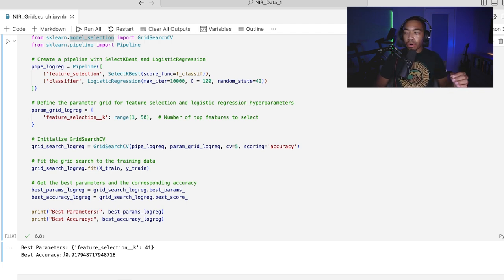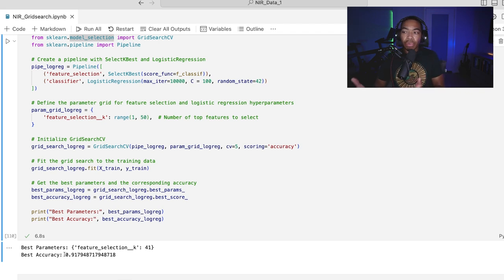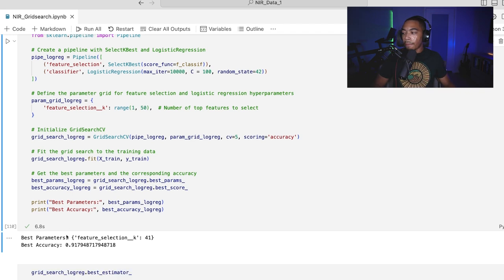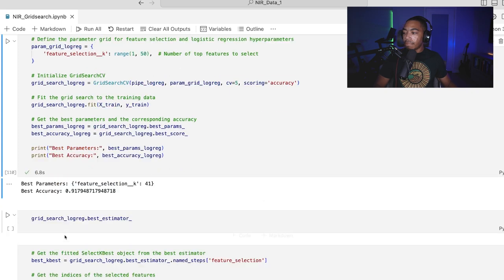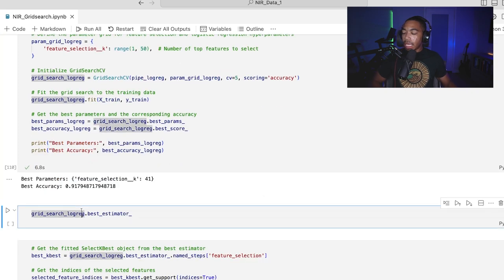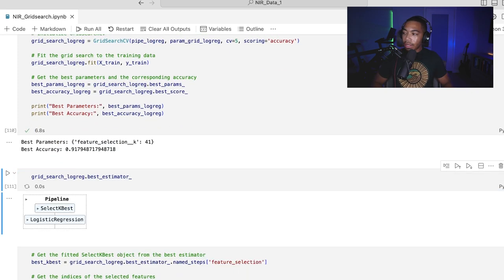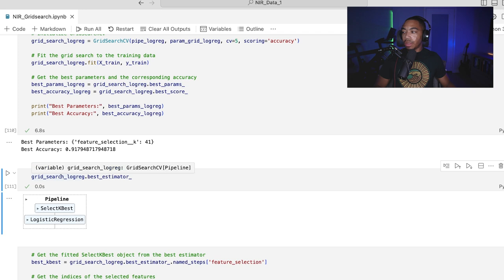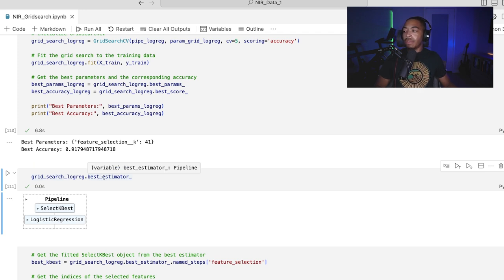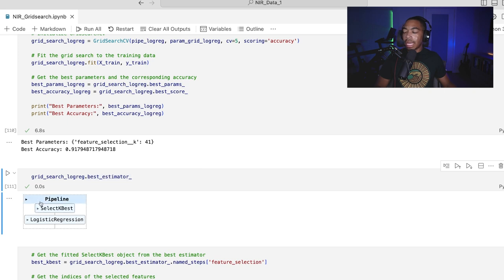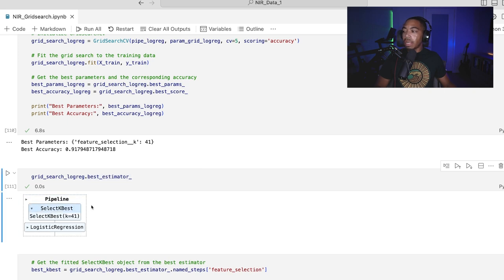And our best accuracy is about 92%. And so you can see, we're just selecting 41 wavelengths that are going to help improve this model. If you want to visualize the best estimator a little bit differently, we can run this grid search log reg best estimator attribute.